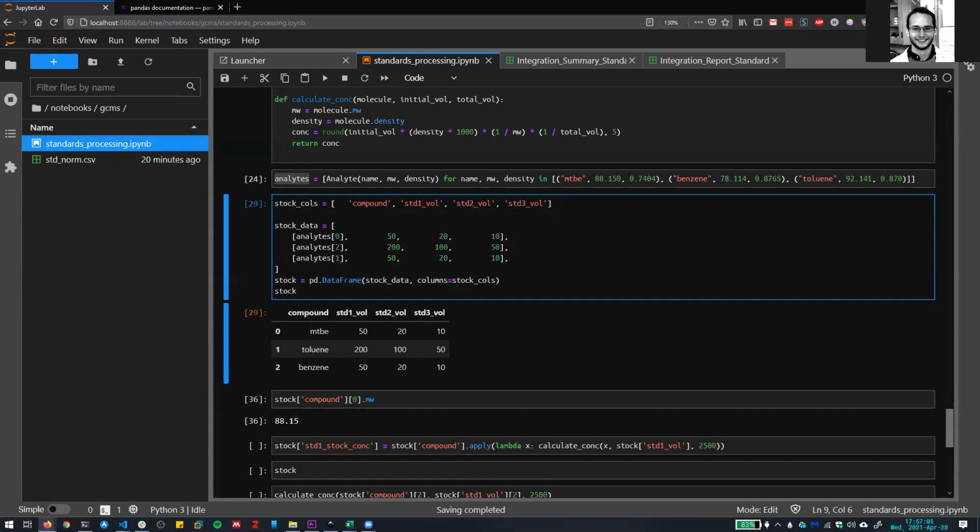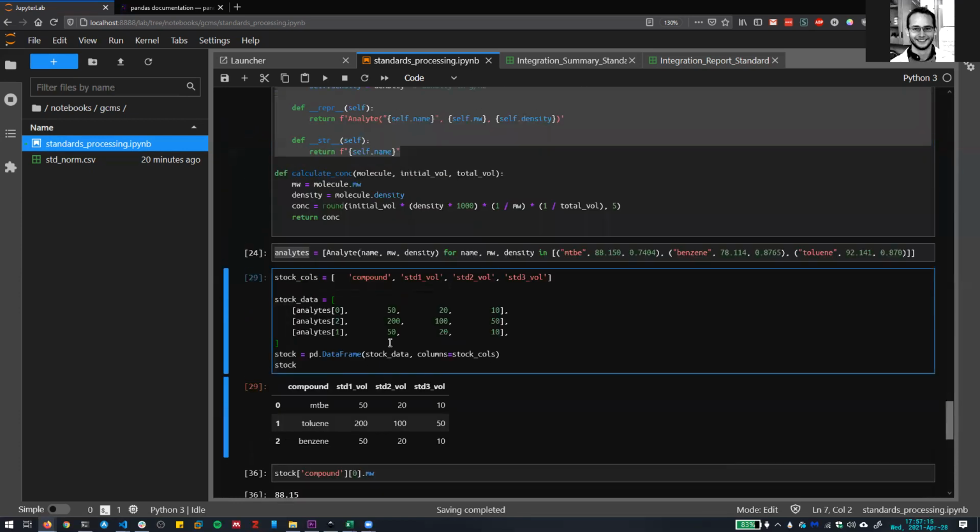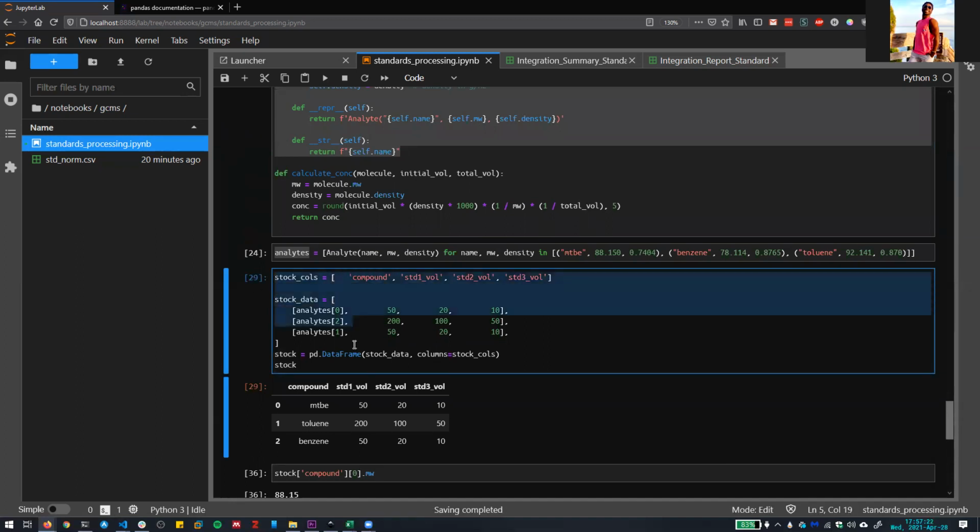Okay. For me, sorry, I just have a lot of issues. For the stock one, I got a key error. It's just a long message saying there's a key error. Was it running this cell here that says stock columns?